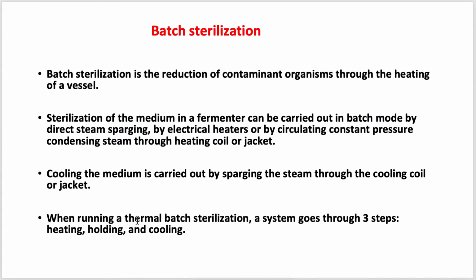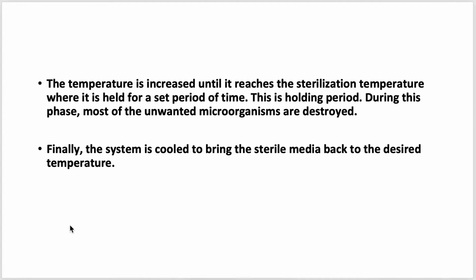Now, when we do sterilization using heat in a batch sterilization process, the system goes through three steps: heating, holding, and cooling.